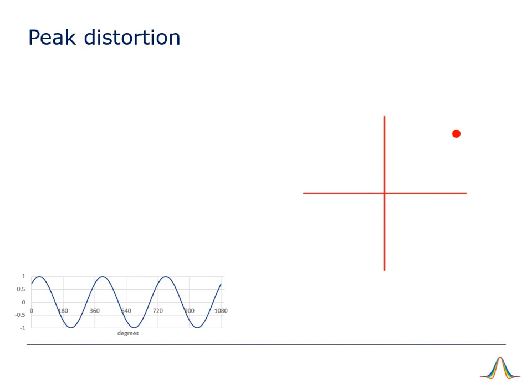Thinking about the position of that red dot in polar terms, the magnitude of the point gives us the amplitude of the ion signal, and the phase angle tells us the starting angle of the ion relative to the cell. If we want to get the corresponding absorption mode peak height, we'll have to take the real coordinate of the red point.